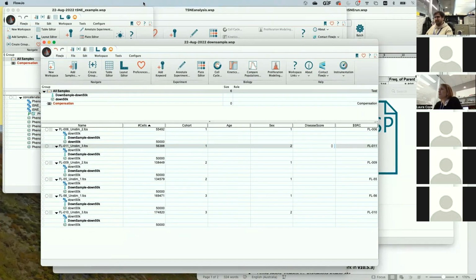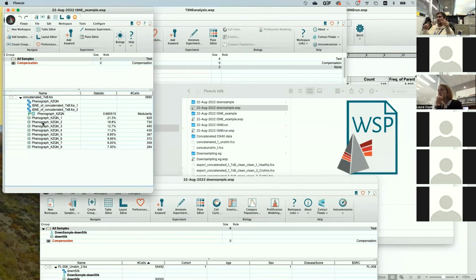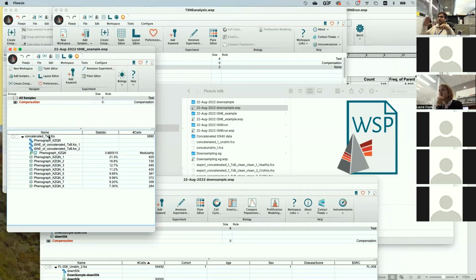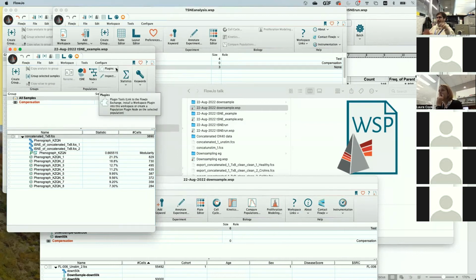That was amazing, Laura. I just got a curiosity. When you've shown the application of the phenocluster or the phenograph, the clustering analysis, you've shown something like a heat map. Based on what does the system recognize what's a high expression or low expression? I'm used to doing negative versus positive population. How does the software recognize an upregulation versus downregulation? Does it make sense?